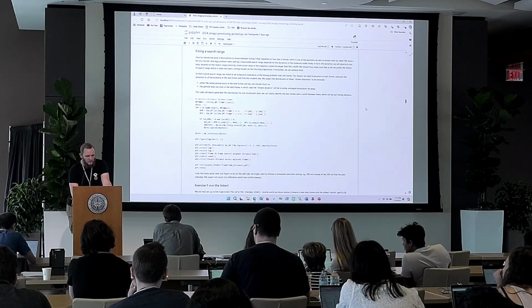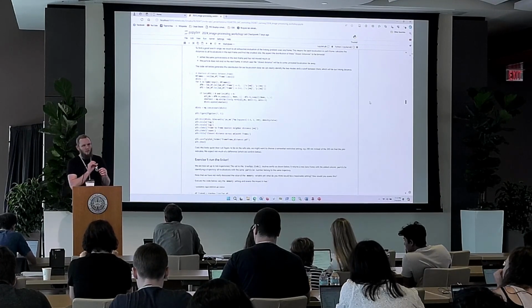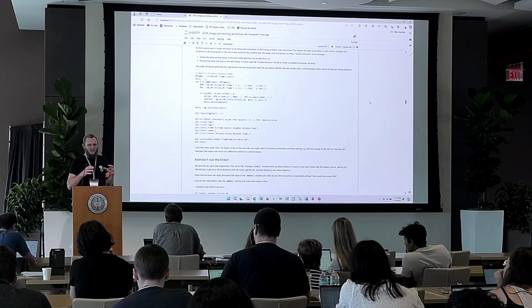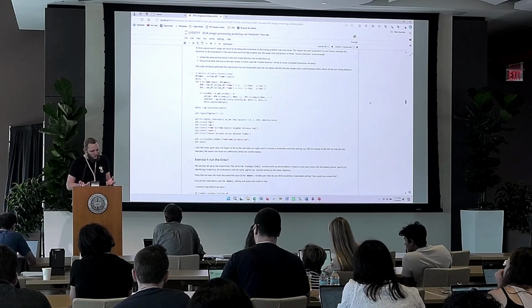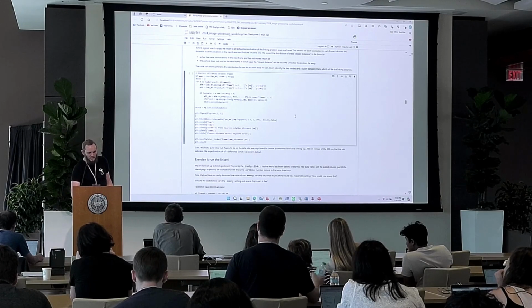One thing I like to do is to basically look at how far my particles move over one frame. Of course, I can't really do this for now, because I don't know which particles in the 2 frames belong to each other. But what I can do is just calculate all the distances that we have and always take the shortest. And that's basically what this code here does.